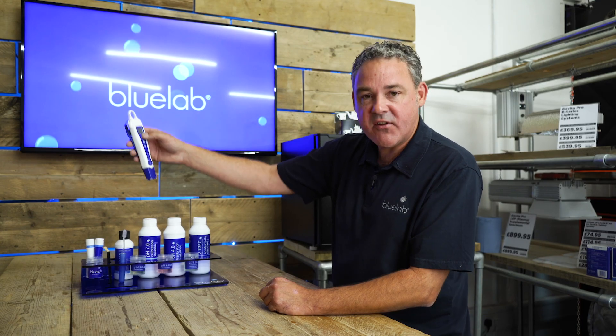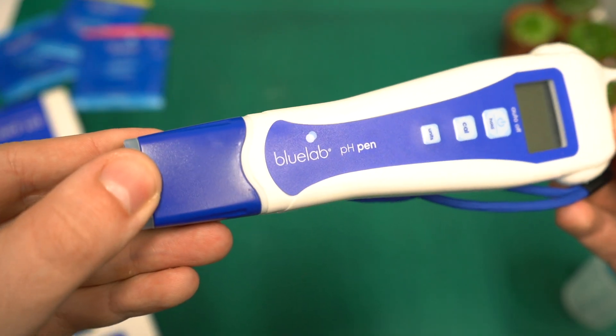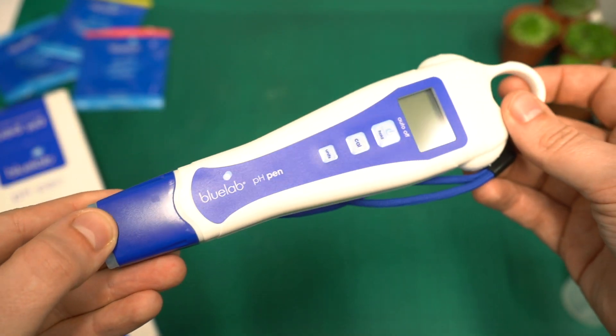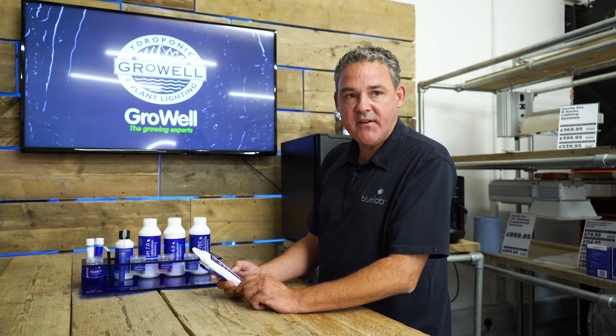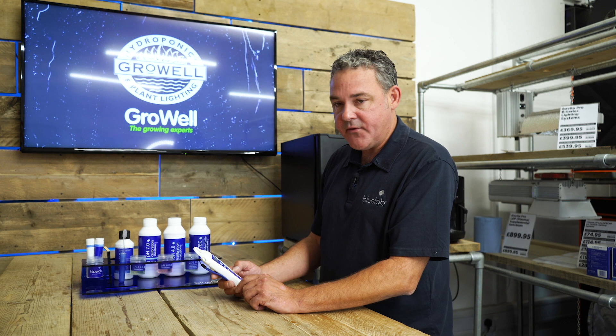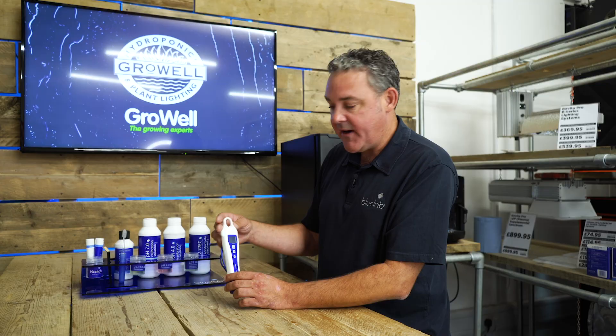If you're taking the pH in an area that's a bit awkward, you just press the top button and it'll hold the reading there for you. We improved the calibration sequence about two or three years ago, so it's now incredibly easy to use. When you calibrate to seven and four you'll see a series of zeros come across the screen — that's the meter checking for stability of the reading. It takes away the issue of calibrating too early and giving you error messages, so it's very simple to use.